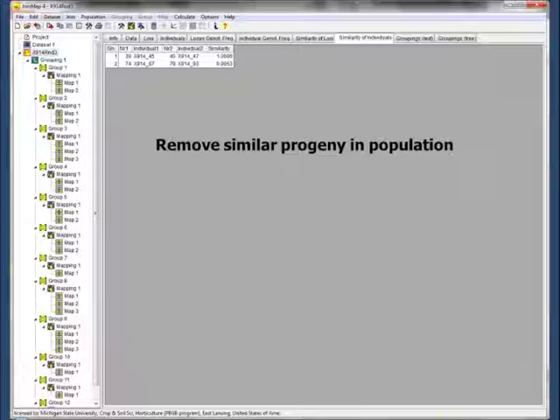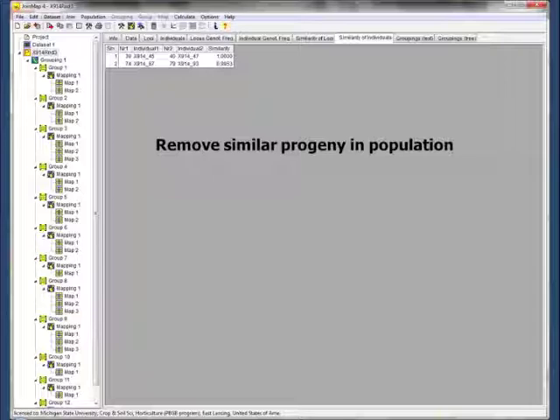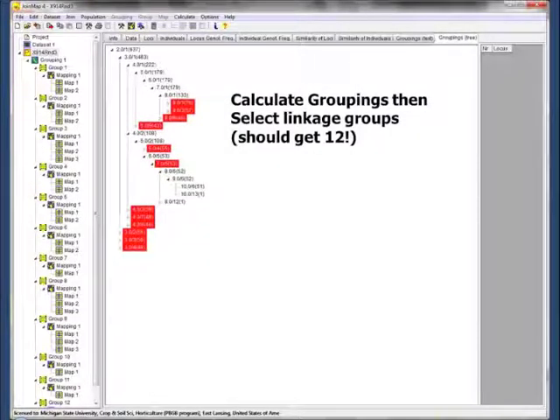Another tool in here is you can look at the similarity of the progeny. Progeny 45 and 47 had a similarity of one, so we pulled that one out of the population for the analysis because they had identical similarities — for all the SNPs we looked at, they were identical. Whether they actually are identical or not, I'm not really sure. There was a second one that was 99% similarity, but we kept that one in.